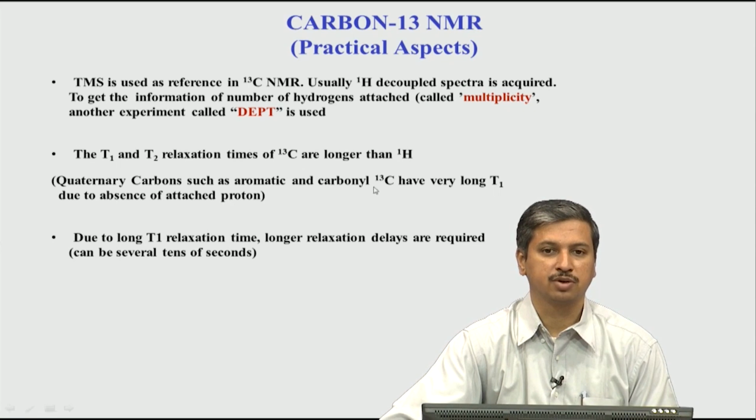So, in that picture the time delay between the FID is collected and before the next pulse, we use the word relaxation delay, and that relaxation delay, if you remember, we said depends on the T1 value. So, typically the relaxation delay is about 4 to 5 times the T1 value of the sample. So, for protons it is typically a second.